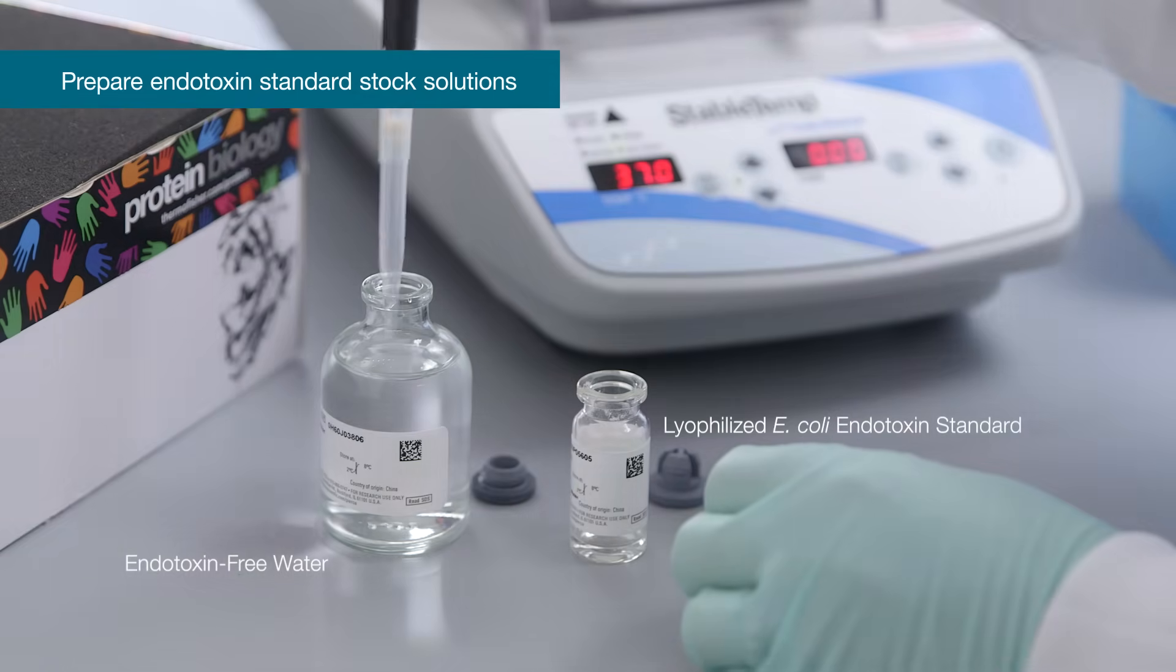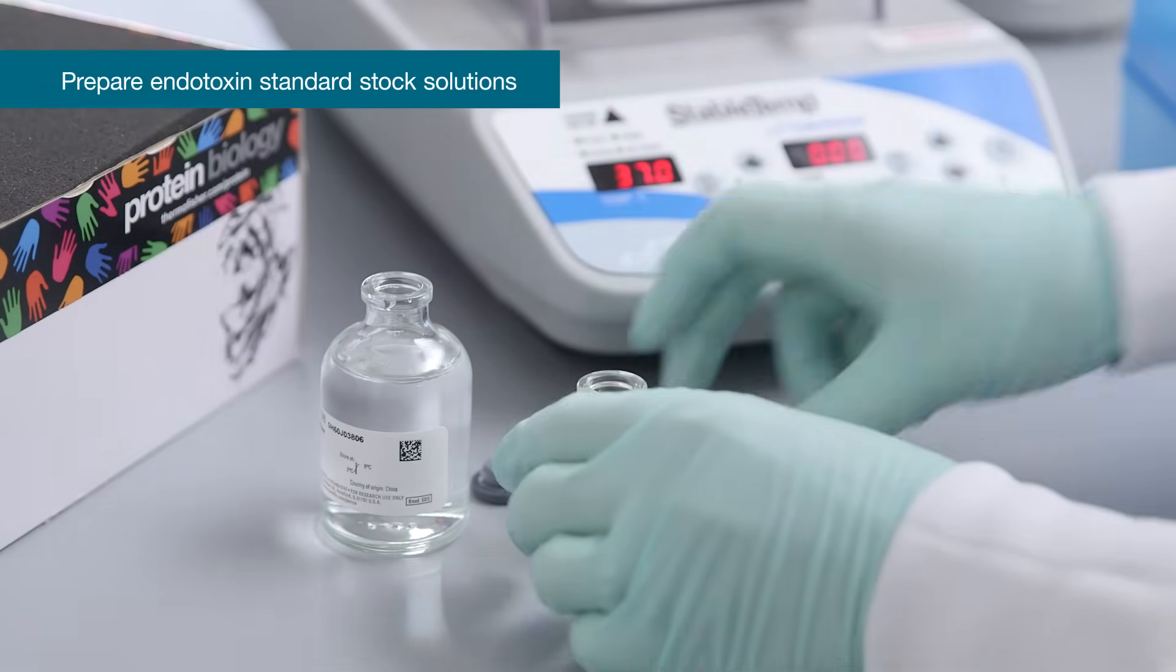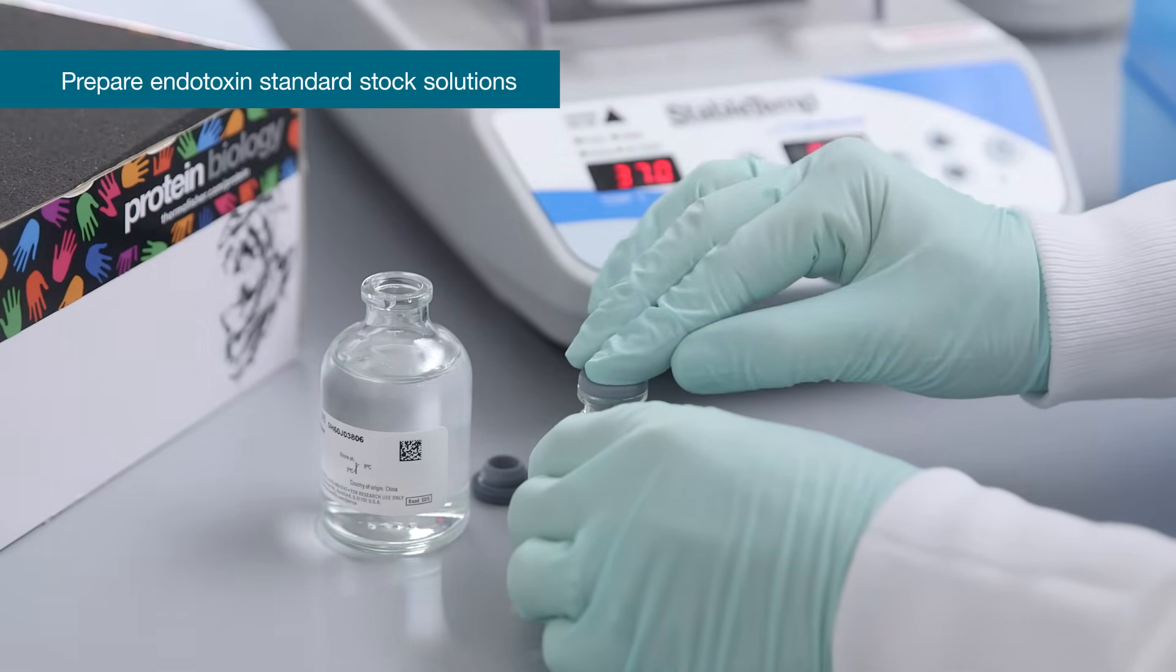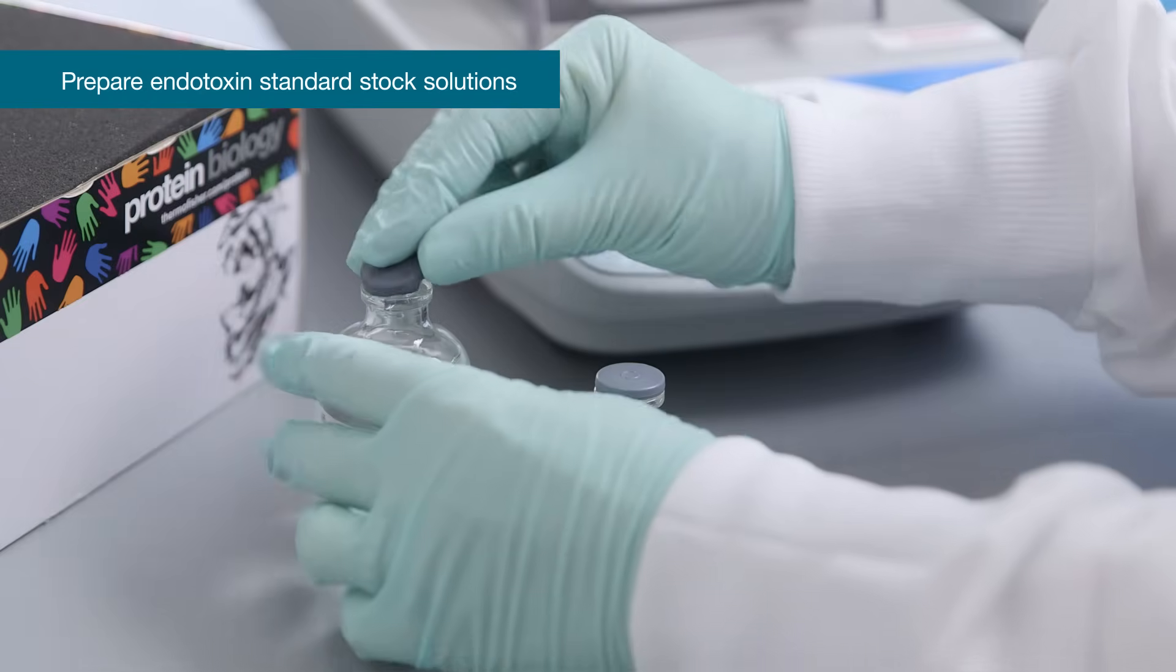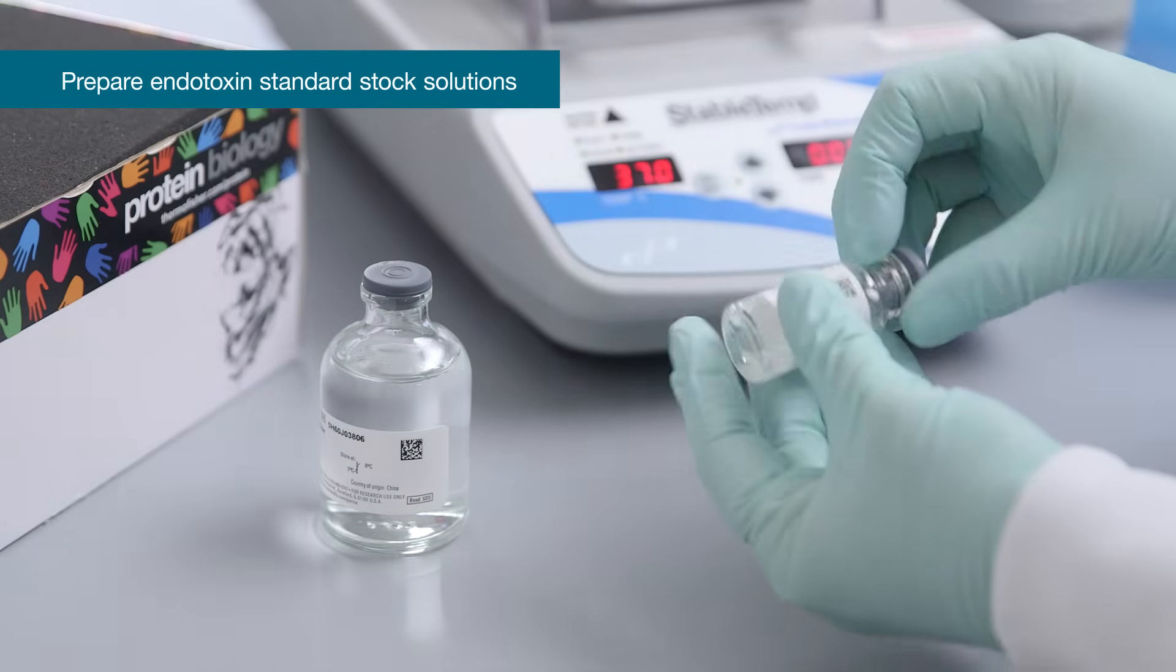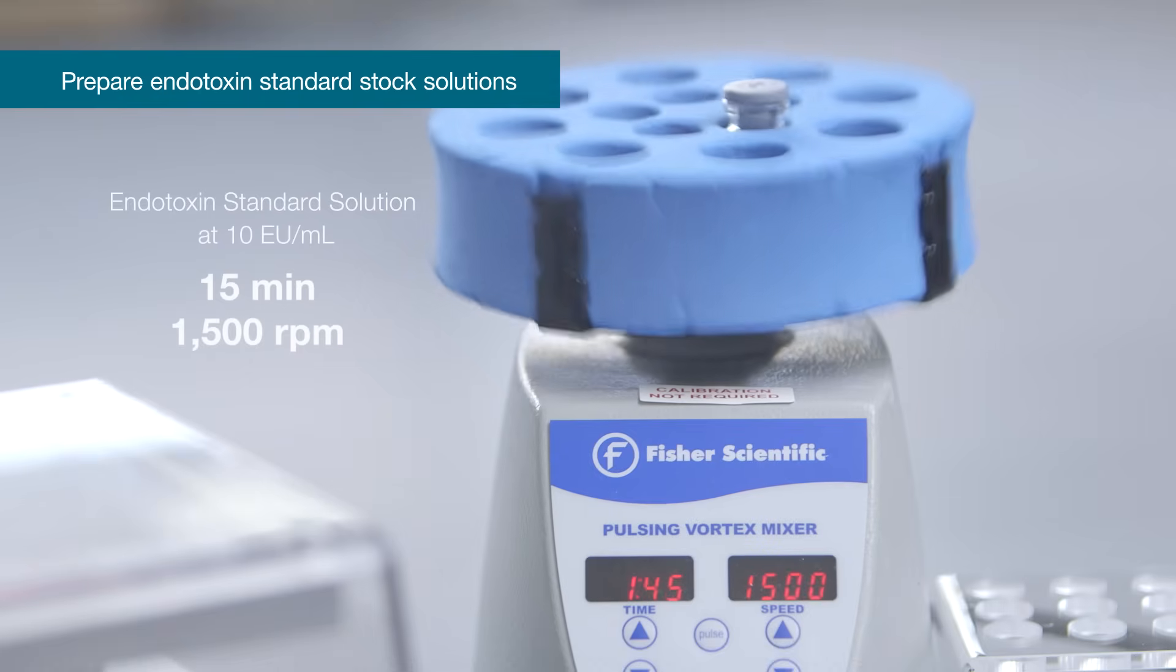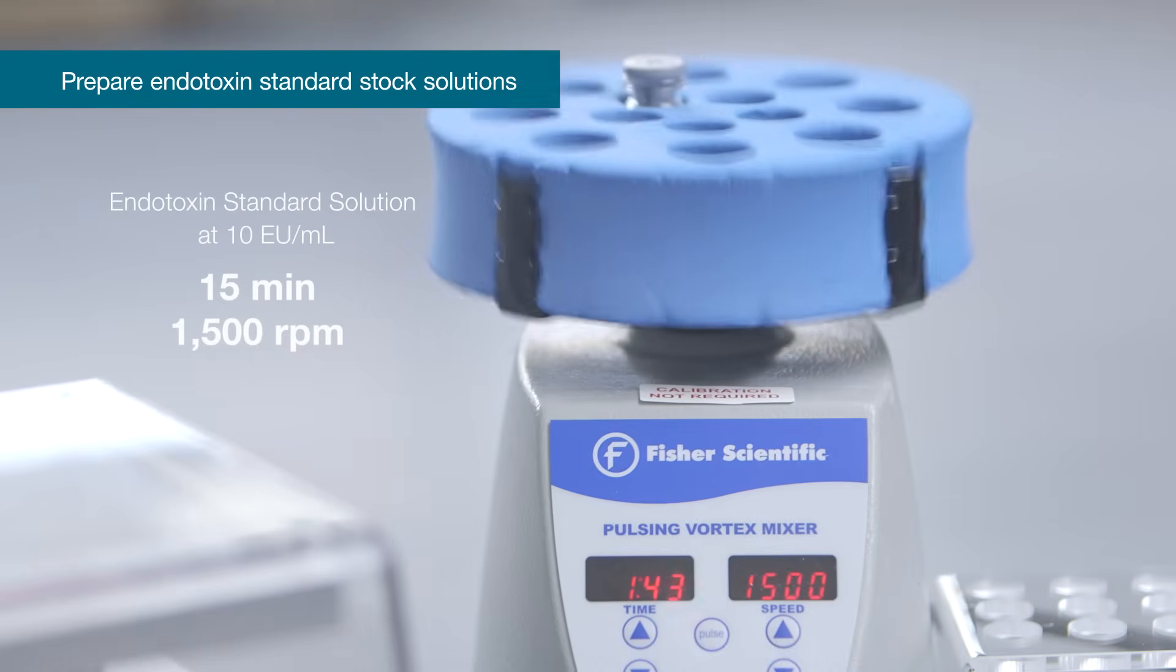Reconstitute the content by adding the appropriate amount of endotoxin-free water needed to make endotoxin standard solution at 10 endotoxin units per milliliter. Vortex the solution vigorously for 15 minutes at 1500 rpm.